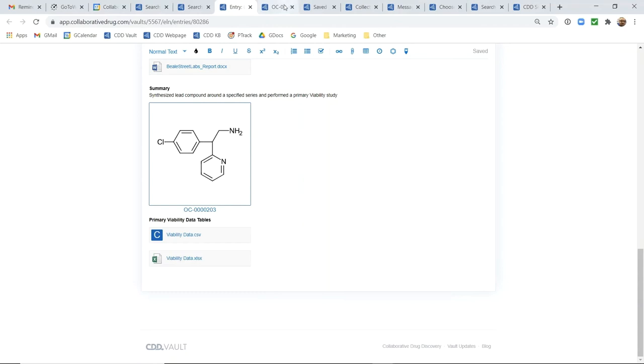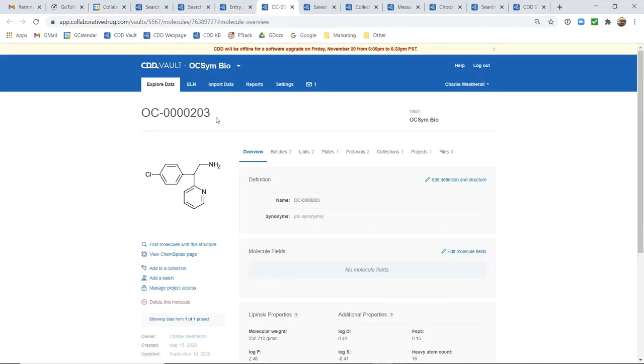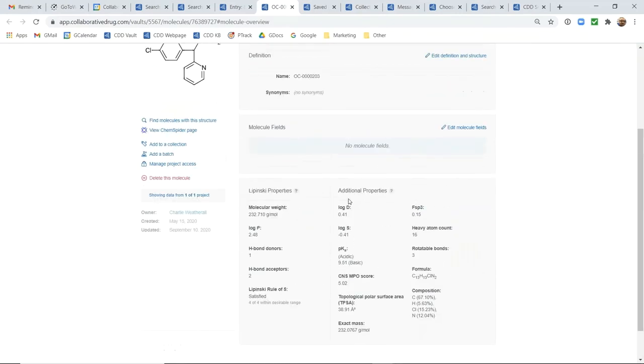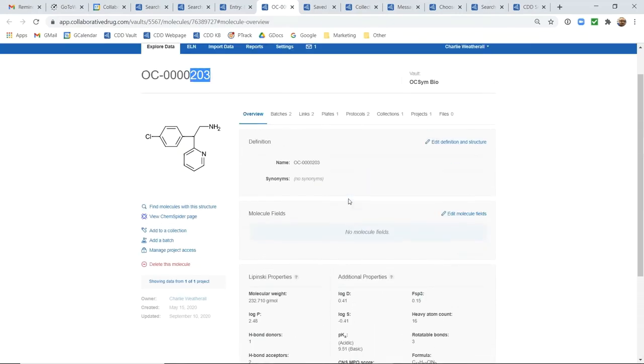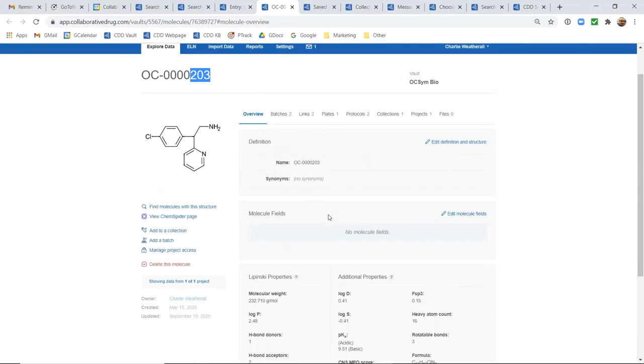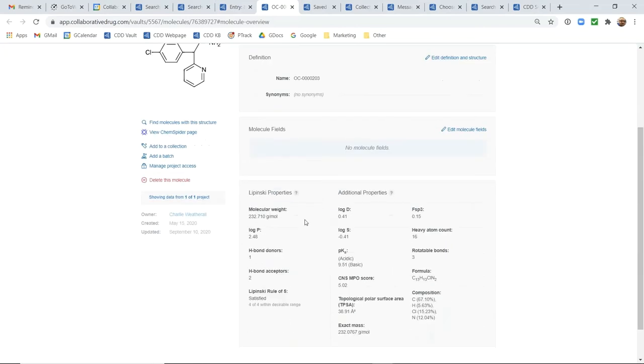So we'll take a quick detour and go to the OC203 molecule here. You can see all of the information just by clicking through on that molecule ID that's available in my entire CDD vault platform. So all of the chemical properties that we've calculated based on the chemical structure are here.